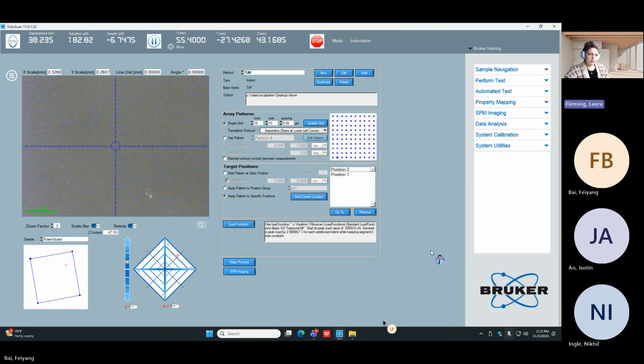Okay, so that concludes tip area function and machine compliance and all the nuances around that. Like I said, before our next meeting, I'd like you to run it again on the raw data, just to make sure that it can stick. I think struggling through it on your own is a good first step. And in this case, we have a known outcome, meaning that we know what the result should be. Our remaining outstanding topics are now imaging, property mapping, and Scratch.